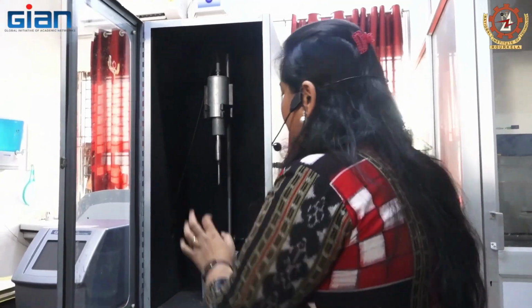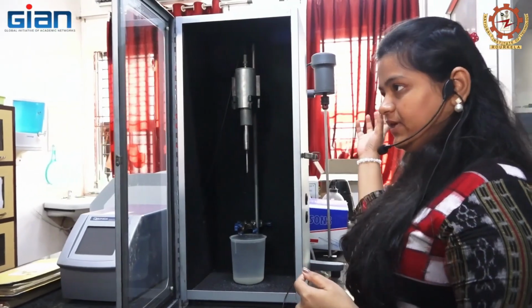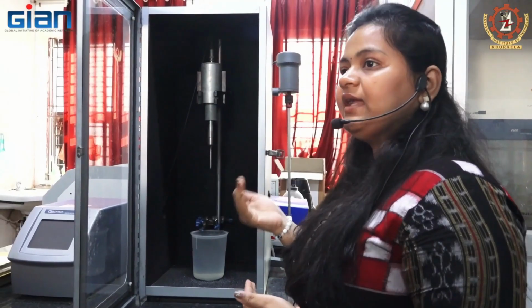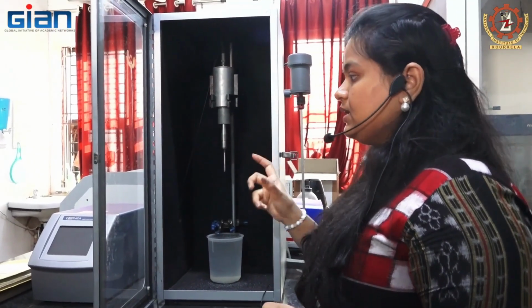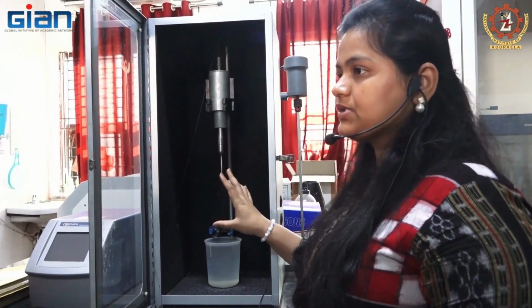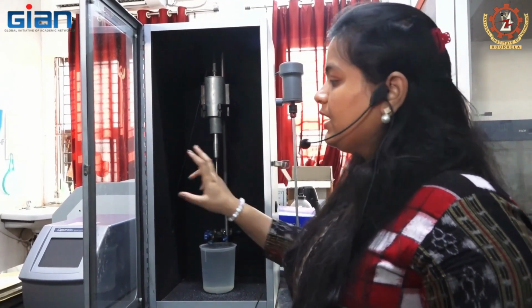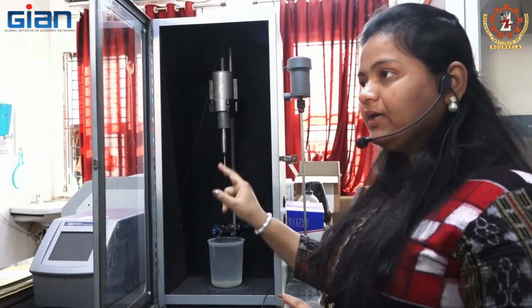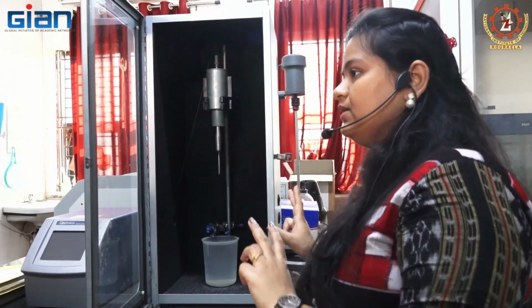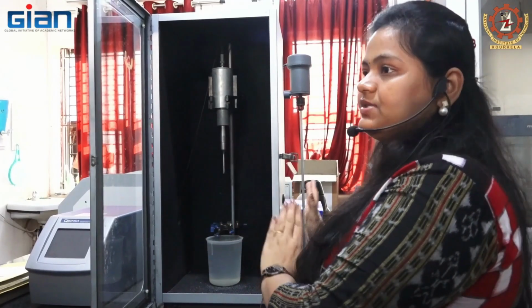Got my point? Okay. First is the generator. The generator converts the electric field given by the electric source to high intensity electric signals. It also affects the intensity, power, amplitude and frequency of the ultrasound. At which power, at which frequency, at which amplitude you intend to extract will be decided by the generator. You command the generator how much amplitude you want, and then it will give that amount of electric signal to us.